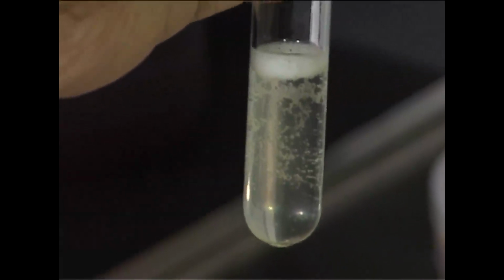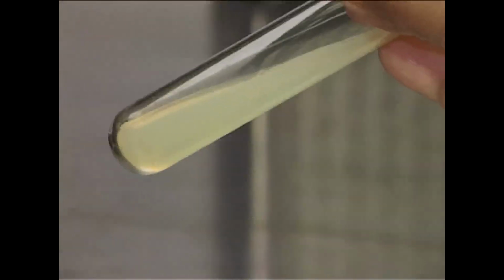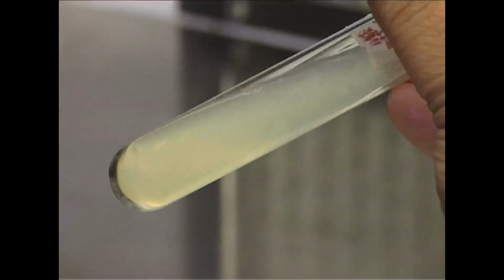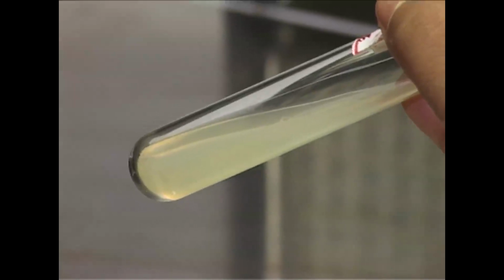TSI agar, very interesting. So in case of TSI agar, the streak or stab is made, right? So you can follow the yellow slant or yellow butt, okay, as well as you can follow the gas or bubble formation, but you cannot follow the black precipitation by H2S production. So that is also the confirmatory test of E. coli on TSI agar.